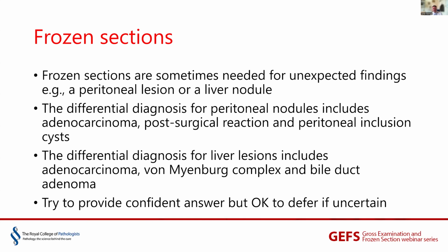You might have a bile duct hamartoma or a von Meyenburg complex. They typically contain bile, and they typically have quite a bit of stroma and these geographically arranged and shaped bile ductular structures within them without infiltration at the edge.